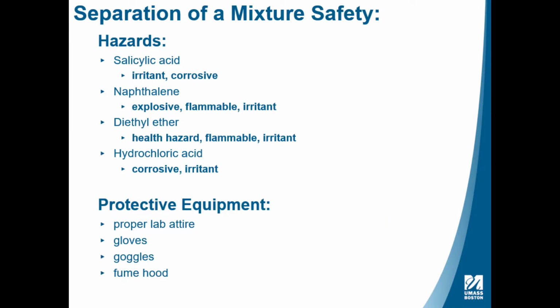Some of the chemicals we will be handling have associated hazards. Salicylic acid is an irritant and is corrosive. Naphthalene is explosive, flammable, and an irritant. Diethyl ether is a general health hazard, flammable, and an irritant.